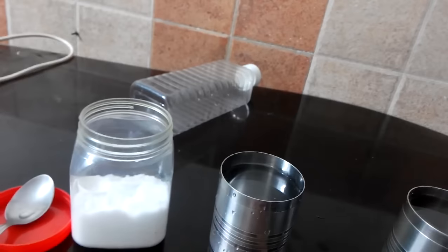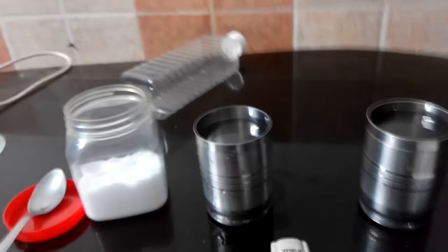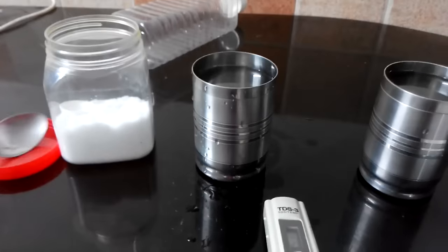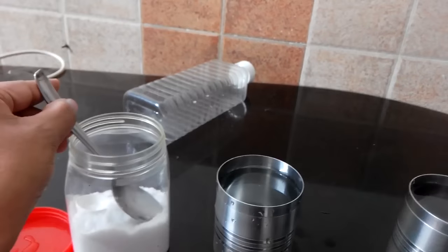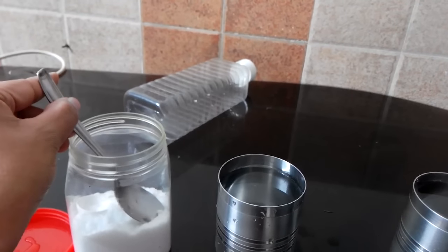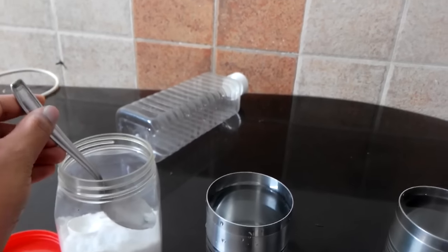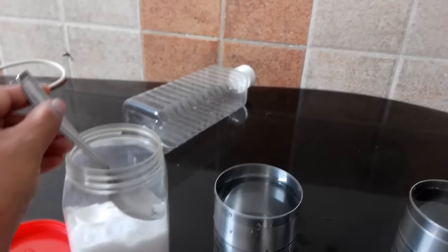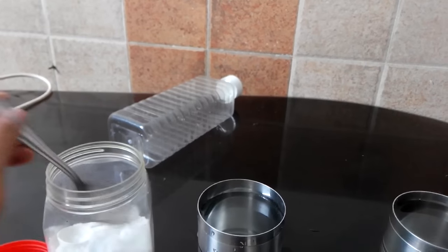I also have some salt here. I just wanted to test whether the TDS increases if I put some salt in the water. Ideally it should increase because it's dissolved solids in the water. Also, the range of this device is 0 to 9,990 ppm. If the water has more TDS than 9,990 ppm, you would get an error on the display.